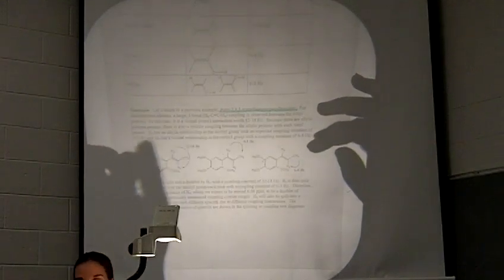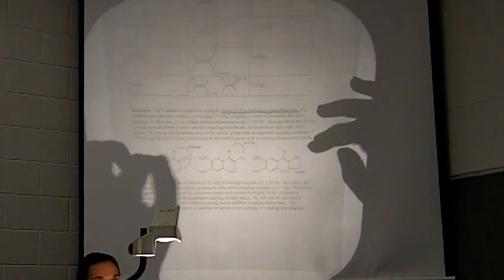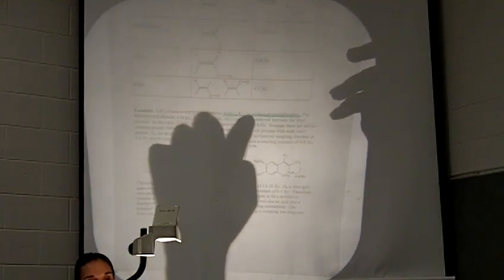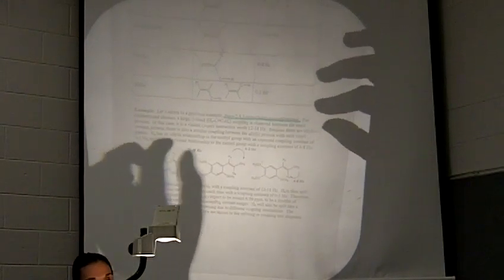They use an example where we're looking at what's going on in the double bond, though we could also look at coupling of these two protons. But what they are looking at is across this double bond. It's the trans 2,4,5-trimethoxypropenylbenzene, this compound here.